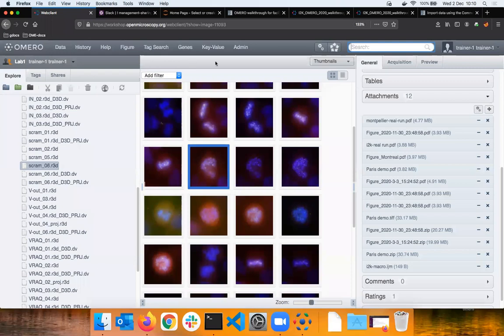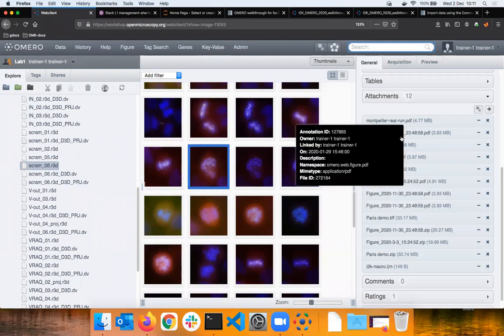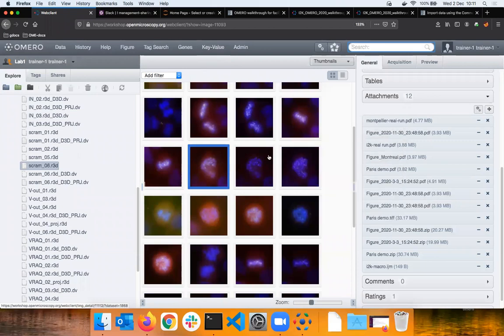What will be stored in that OMERO server is the thumbnails, the thing that Peter is showing in the central panel, and all the attachments, like the collection of PDFs Peter has. Those will be stored in the OMERO server, but the images could live elsewhere. The physical raw data will live completely somewhere else, as long as OMERO knows how to point to it. Maybe you could show, Peter, if you scroll at the top, what the link looks like when there is an in-place import, because there was also a question of how we could fix that.